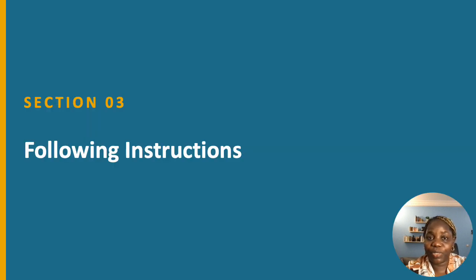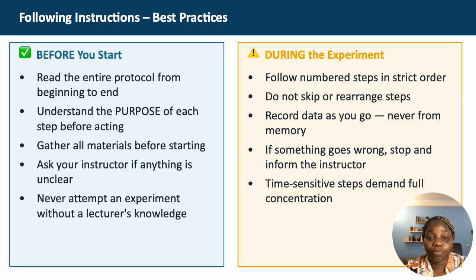Okay, following instructions. This might seem obvious, but in a laboratory setting, failure to follow instructions is the single most common cause of failed experiments and accidents also. So be really careful and serious about that. A very common mistake among students is to start working before reading the full protocol. I will repeat over and over, please read the entire protocol before coming to class, to the lab.